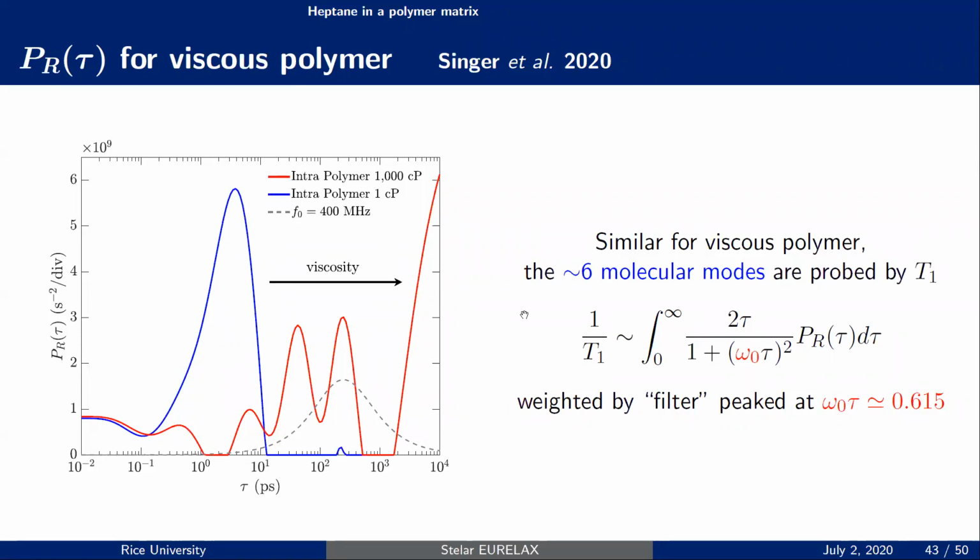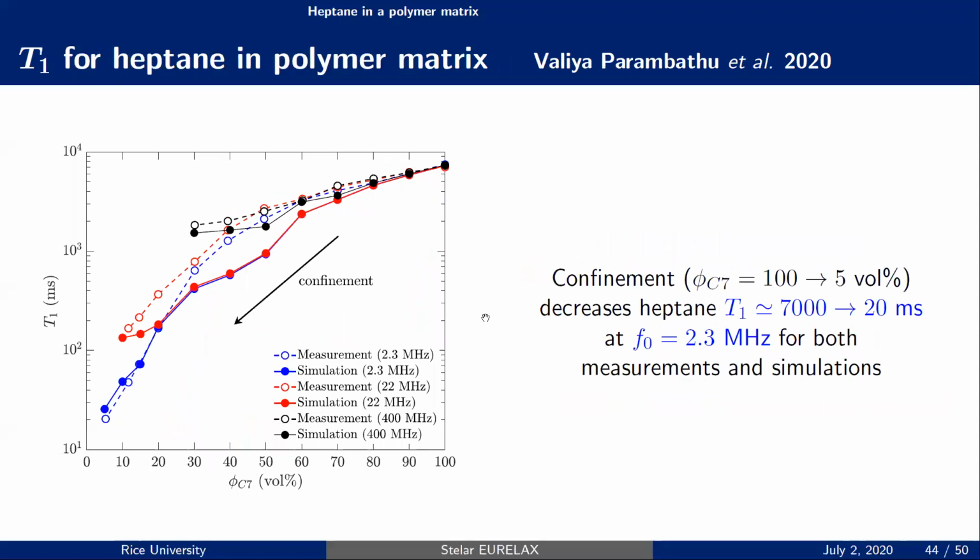we are trying to go towards finding an explanation for the contrast issue that Philip mentioned in the first part of the talk. So now we look at the distribution of T1, the behavior of T1 versus confinement. What you see is T1 rather dramatically decreases with confinement. And this is exactly where the contrast is emerging, okay, as we will show in the subsequent slides.